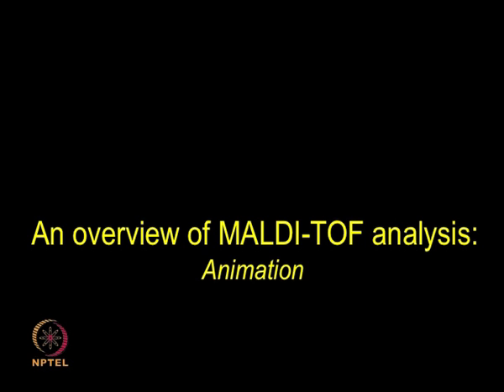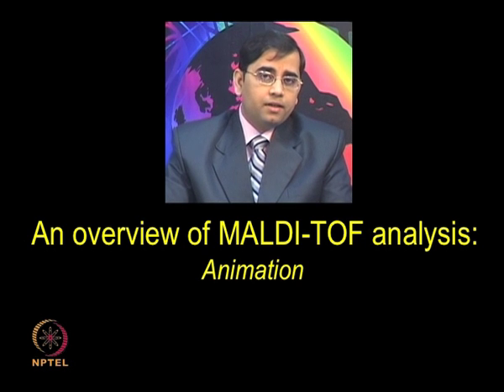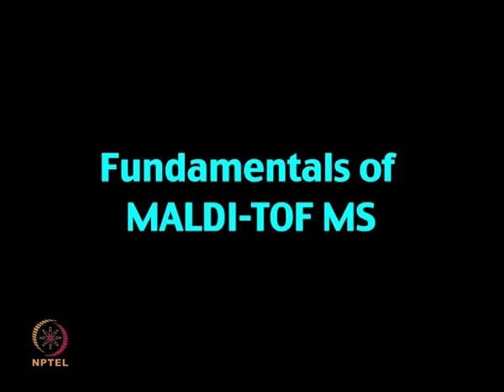After discussing some of these basic concepts of using MALDI and TOF, now let me give you an overview of the entire MALDI-TOF experiment by showing you the following animation. Fundamentals of MALDI-TOF MS.